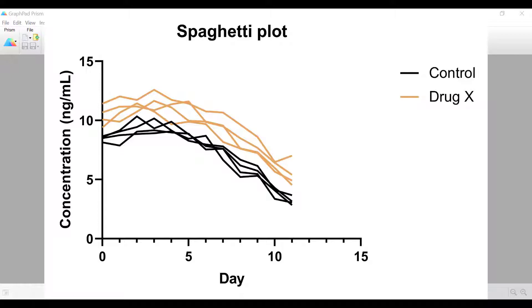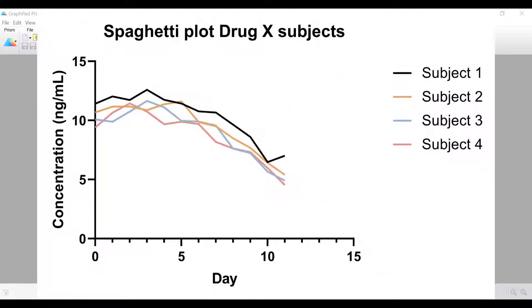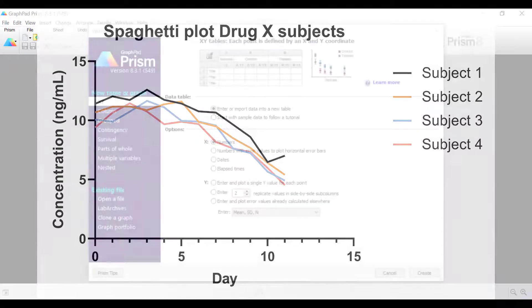The next spaghetti plot variation is one where each subject or replicate in a single experimental group is plotted and the lines are coloured differently for each replicate. In this example, only the data from the drug X group is presented and each subject is coloured differently. This is useful when you want to show the variation of subjects or replicates in one group.